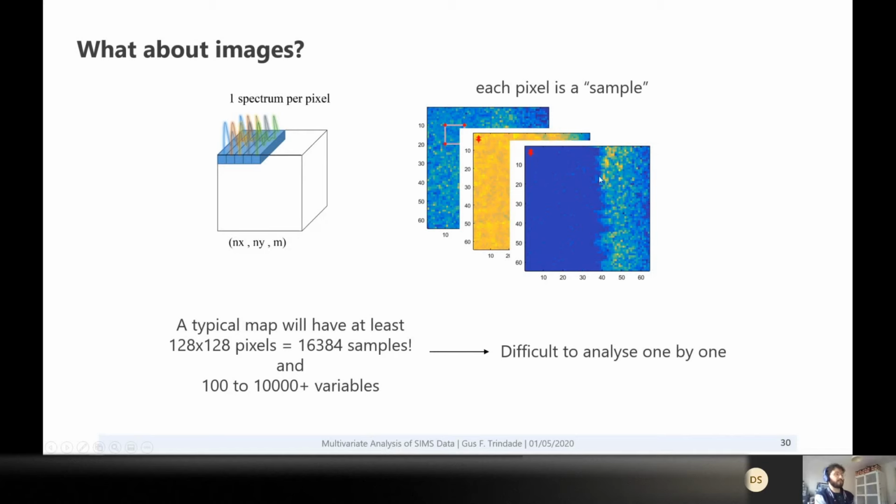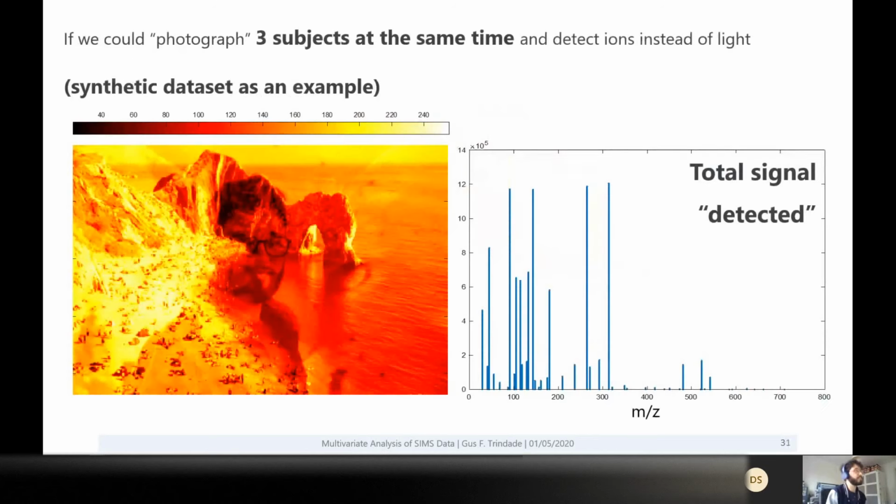So you know how to map these things because they have original coordinates in X and Y. So we can do PCA, NMF, and then instead of using scatter plots, we can see maps of the results.